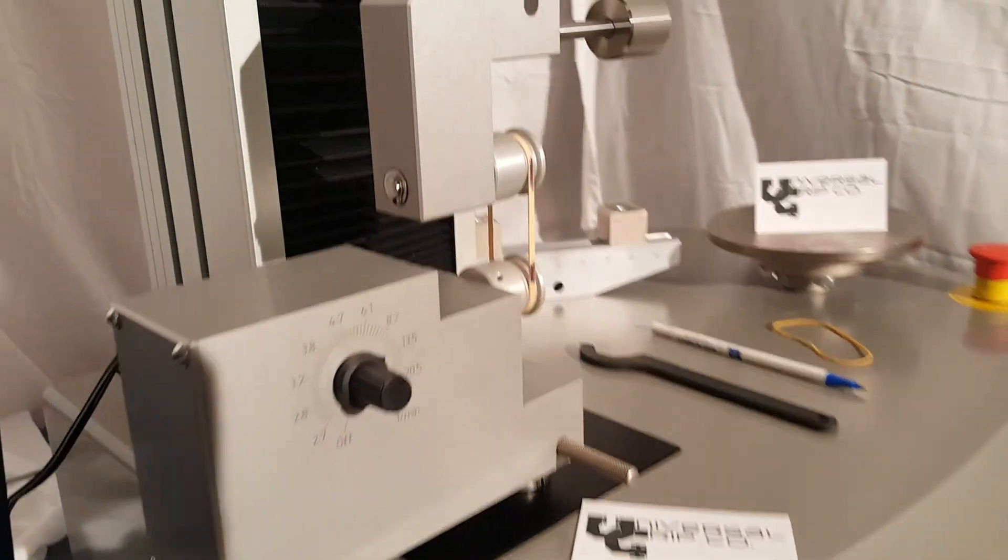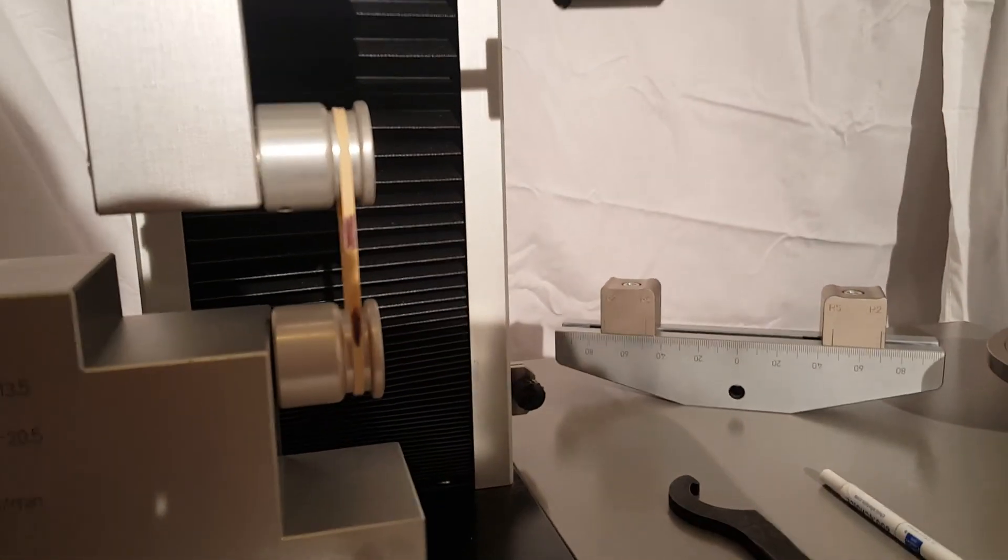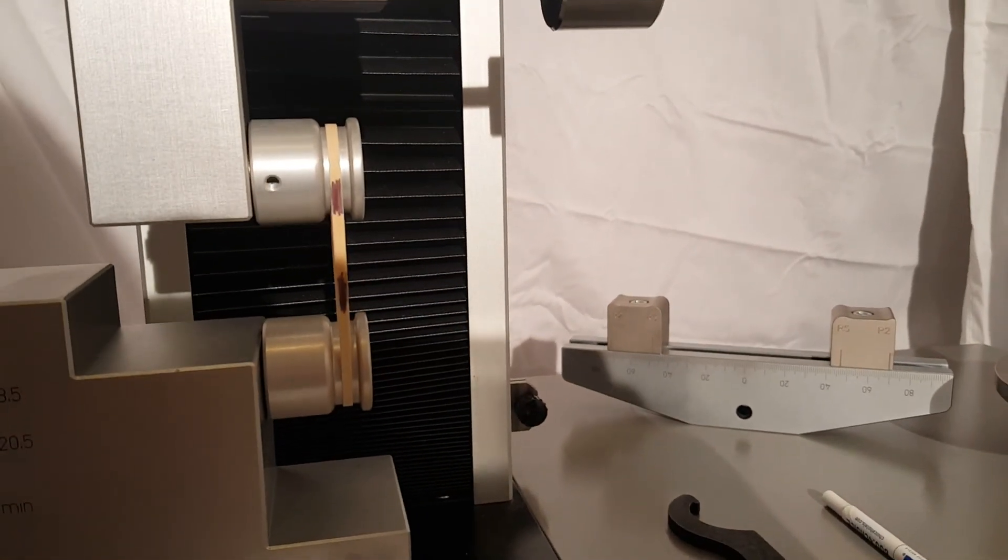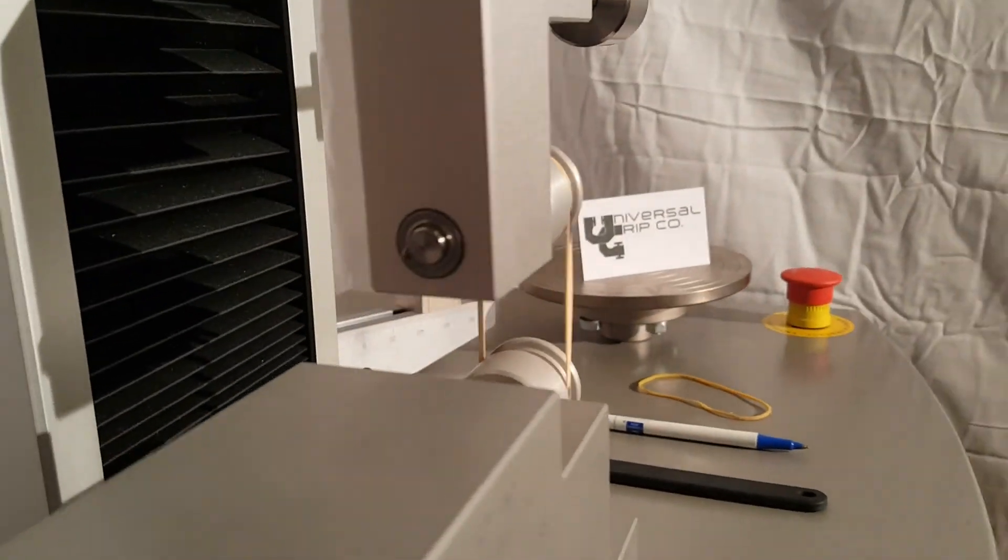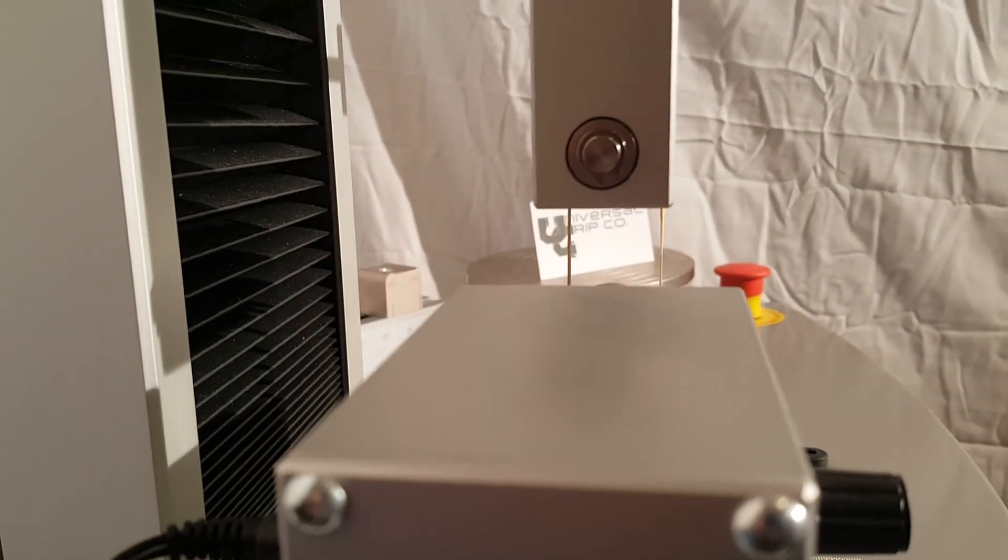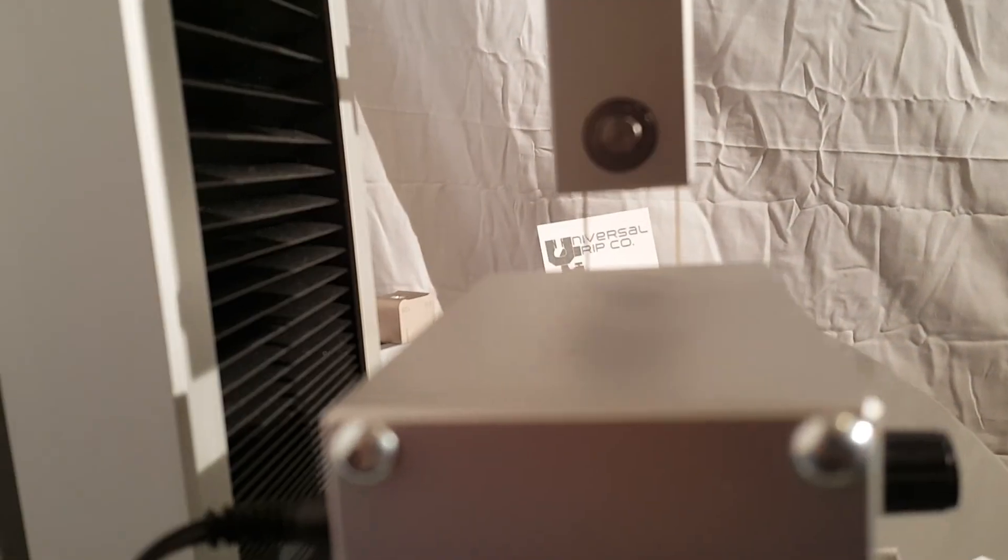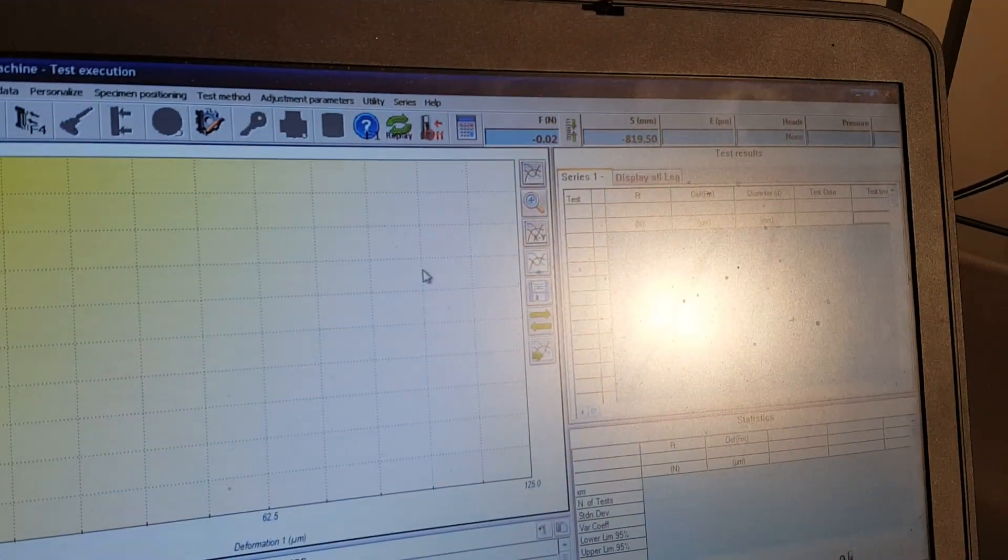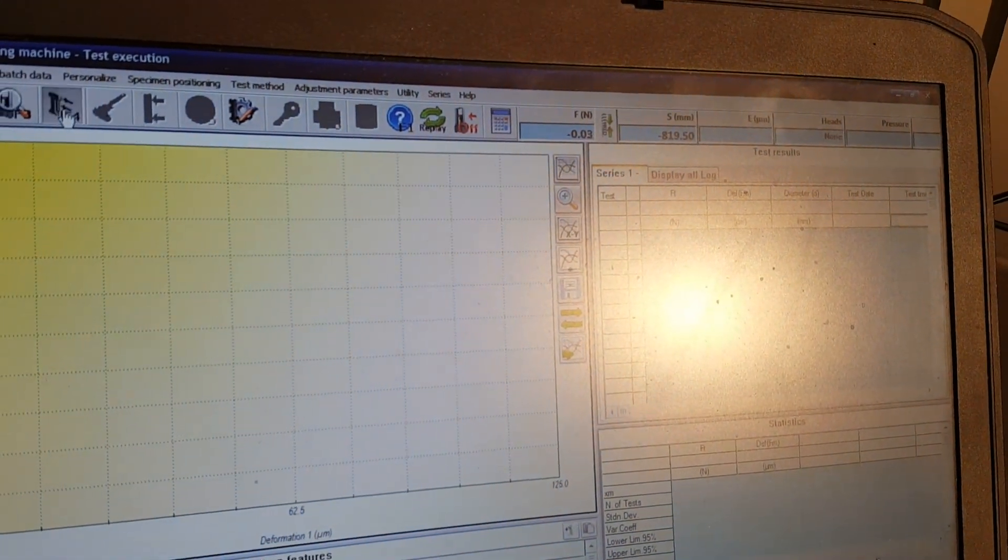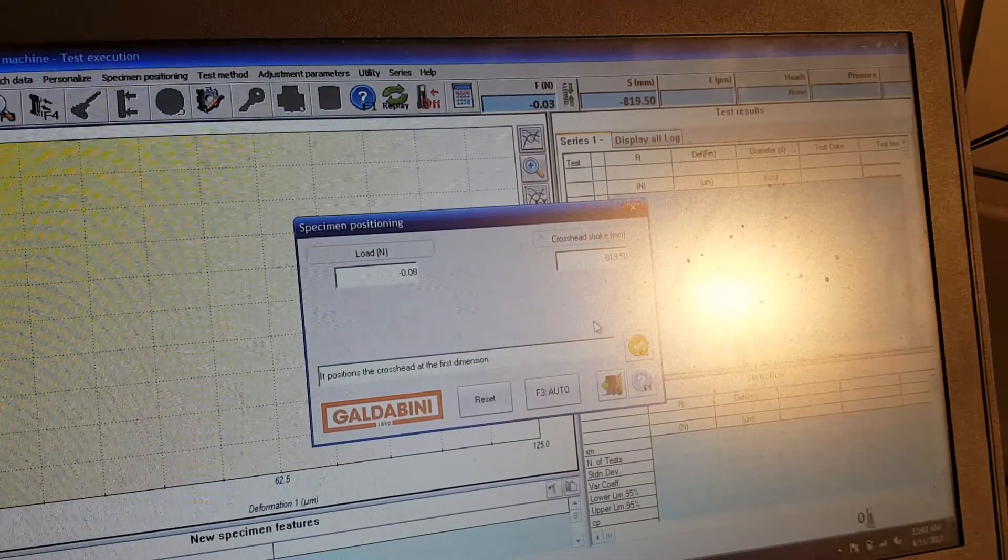Next thing we want to do is make sure that everything's aligned. This looks pretty good here, and also in this direction as well. Let's go ahead and test. I think we're ready to go.